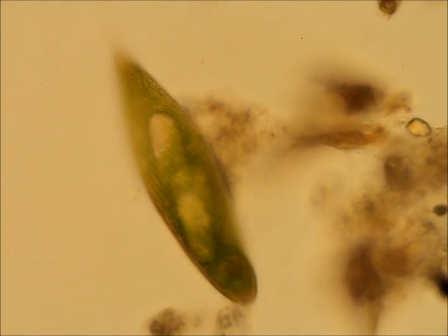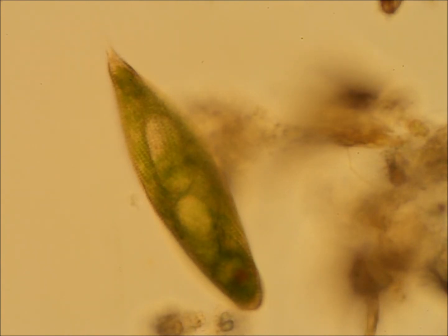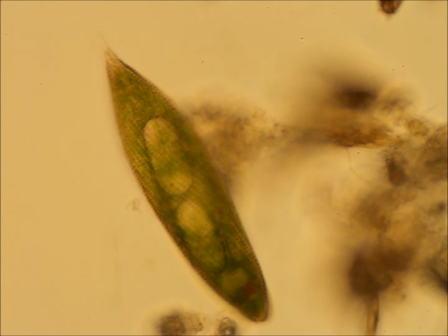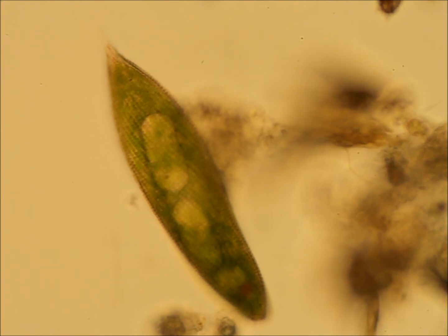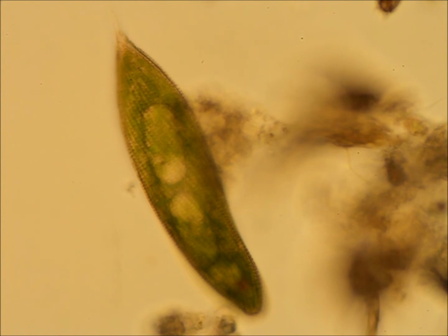Here's Blanche moments before being subjected to a saline solution, and here she is immediately after. When I finally located Blanche, she was alive, but motionless and in a state of dormancy, waiting for favorable conditions to return, and when flushed with distilled water, came back to life quicker than my roommate at an Evanescence concert, but not back to the level of her original spunk, suggesting that her cell wall may not aid well in the deterrence of foreign matters.